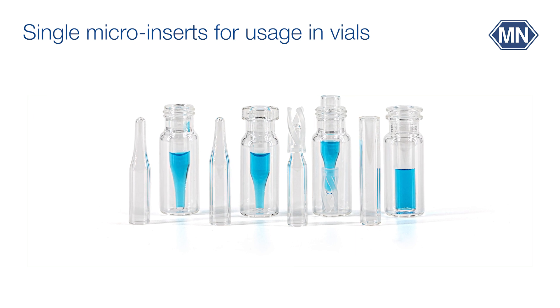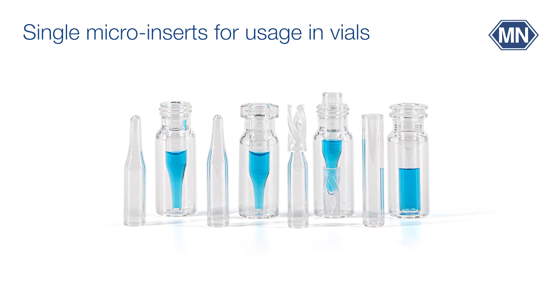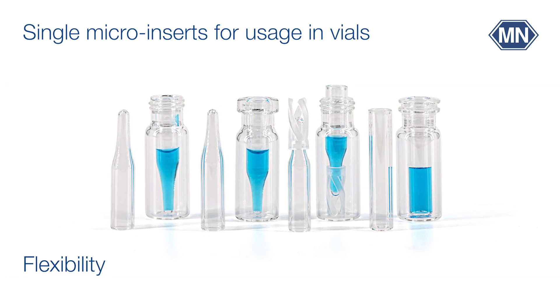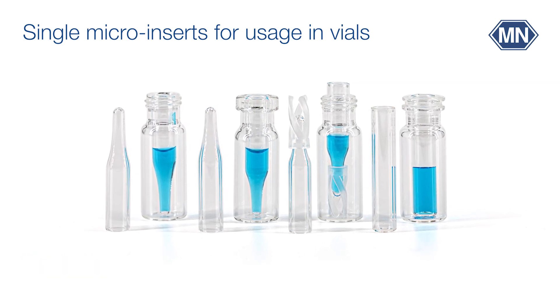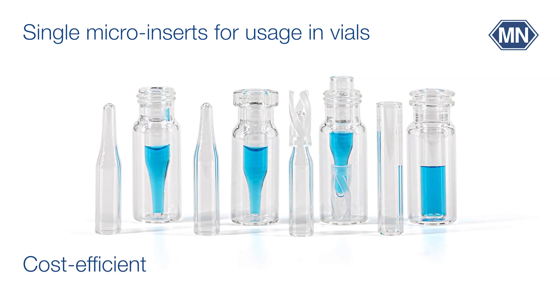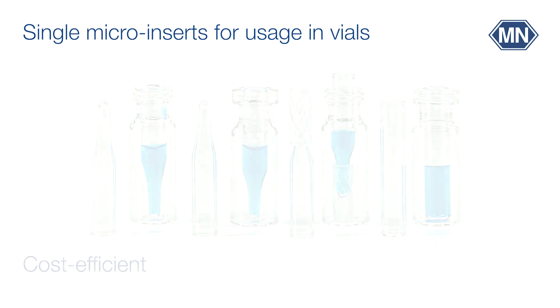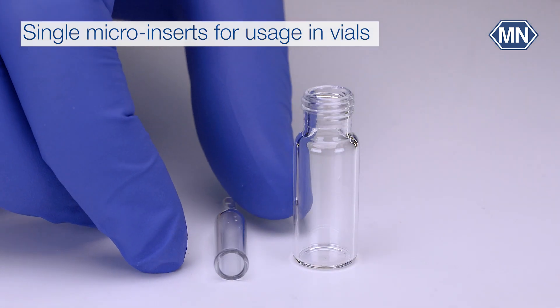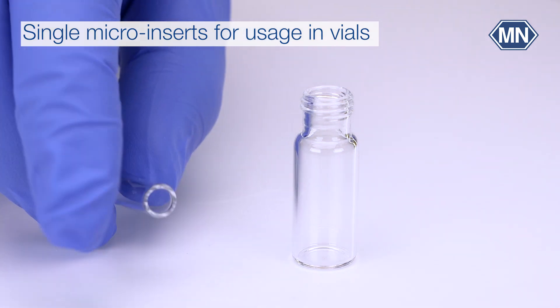Single micro inserts for usage in vials allow quite flexible selection of insert type and the accompanying vial. Furthermore, usage of vials and inserts as separate components is cost-efficient. However, fitting of such small containers is unhandy and involves risks.